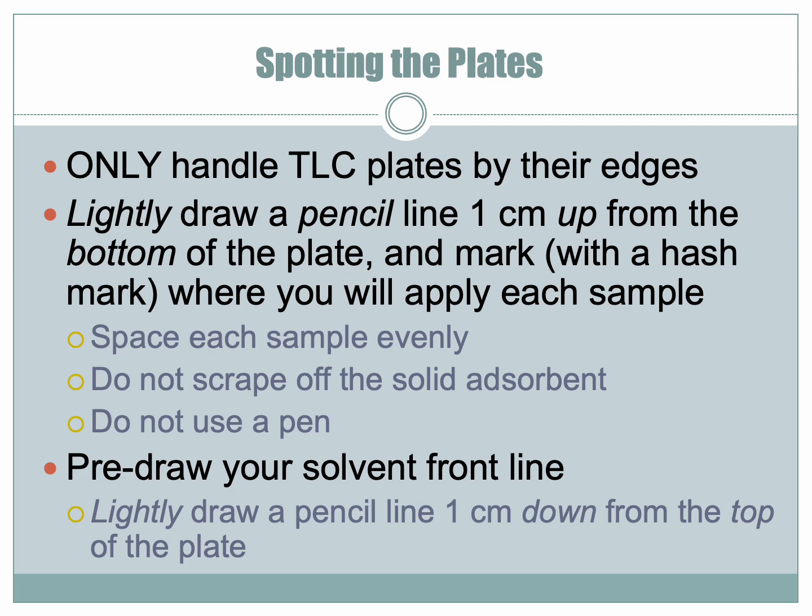So you only handle TLC plates by their edges. And this should make sense because we can absorb organic compounds onto the plate pretty easily, and if you have any compounds on your fingers or on your gloves and you touch the plate, then you're going to contaminate it with other compounds. So we only grab it by the edge.